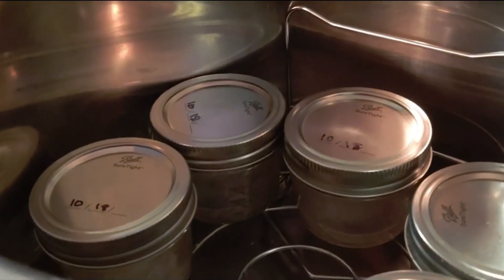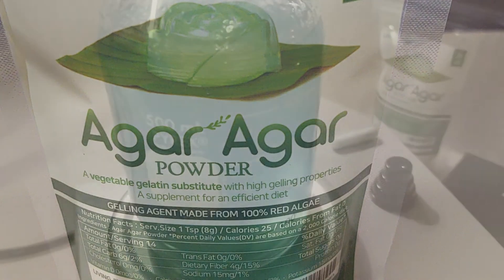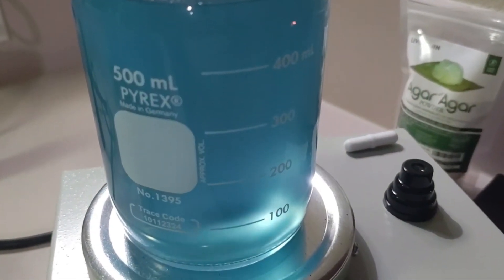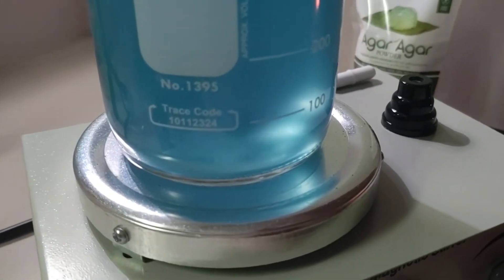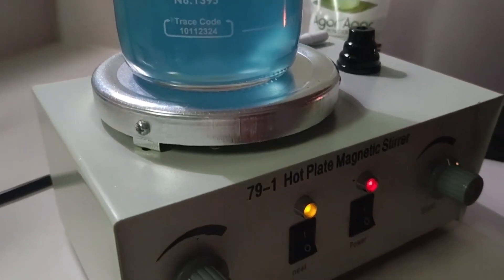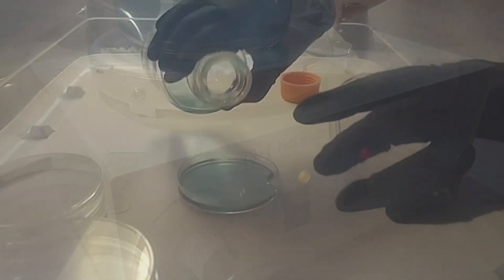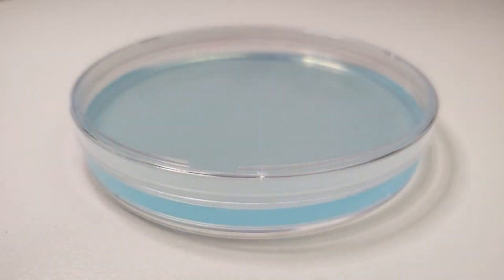Our recipe uses 10 grams of agar for 500 milliliters of boiling purified water, or you can use 5 grams of agar for 250 milliliters of water. The size of your plate and how full you fill your plates will determine how many dishes you will create.